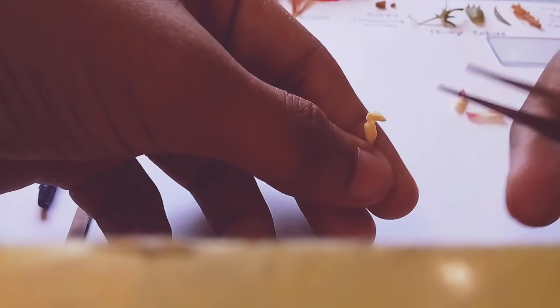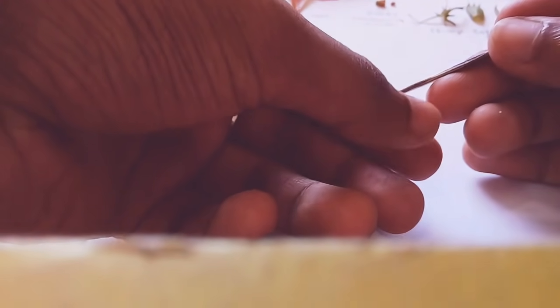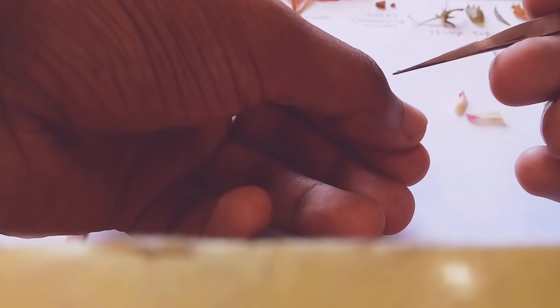This is the ovary part which contains numerous small ovules, so you can squeeze them out. This part contains a large number of ovules, and these are the ovules.